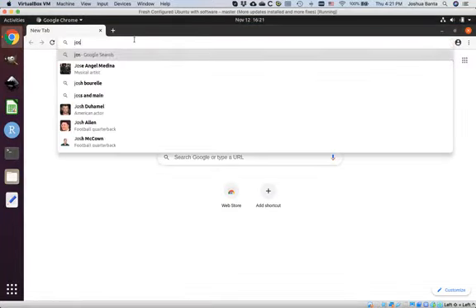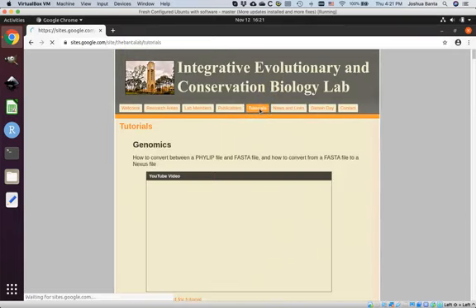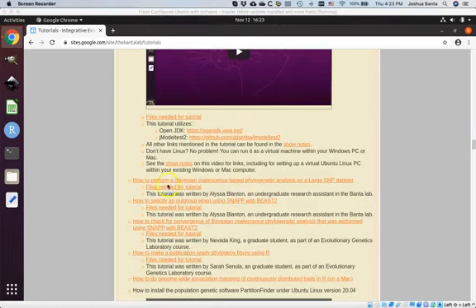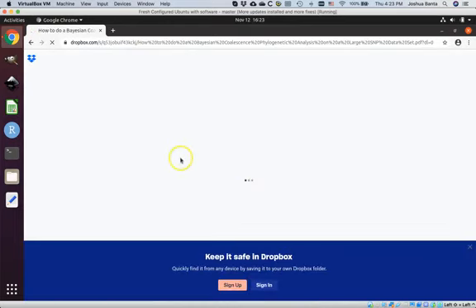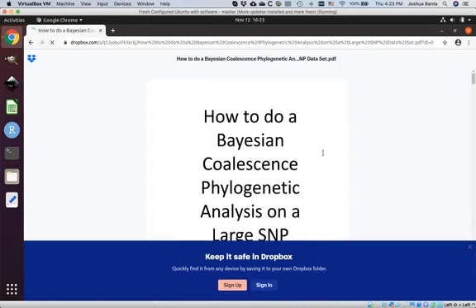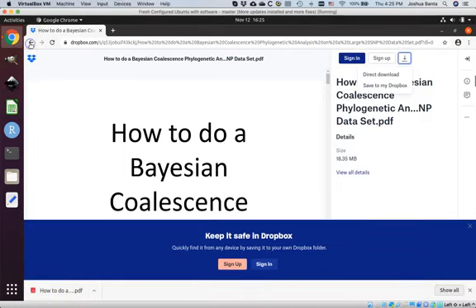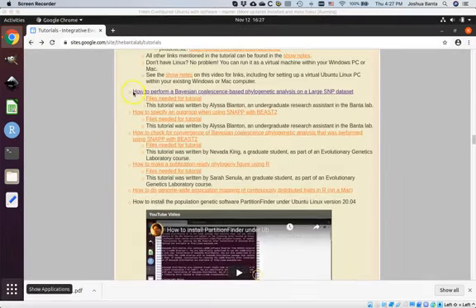Open up a web browser and navigate to my website, joshbanta.com. Click on Tutorials. Scroll down until you come to how to perform a Bayesian coalescence-based phylogenetic analysis on a large SNP data set. Click on 'how to perform,' and this pulls up a document-based tutorial. You don't need to sign in and you do not need a Dropbox account. Click the Download button and select Direct Download. When completed, as indicated at the bottom of your screen, hit the Back button and return to where we were.